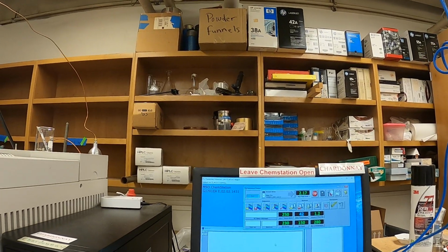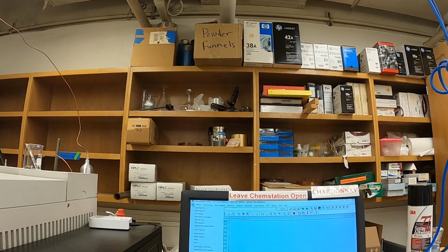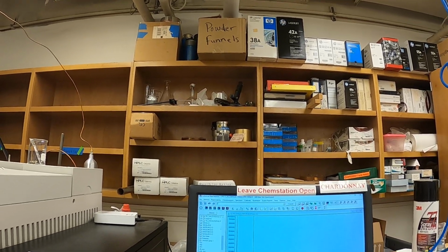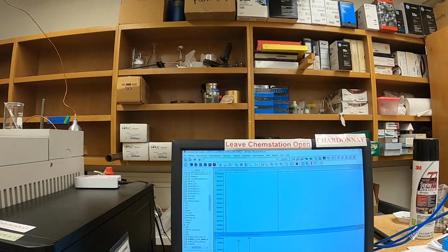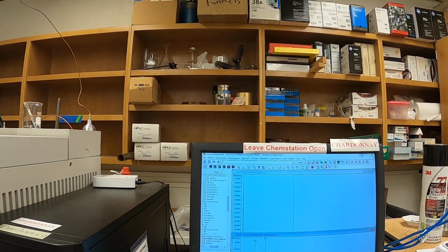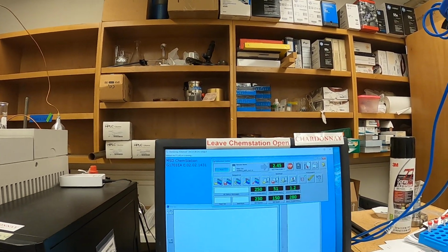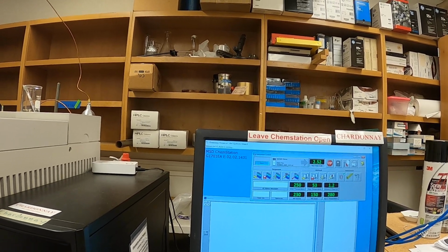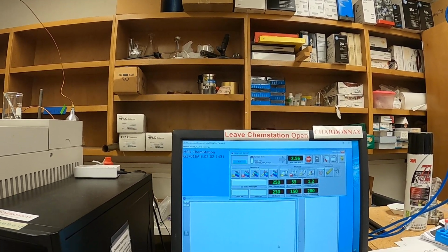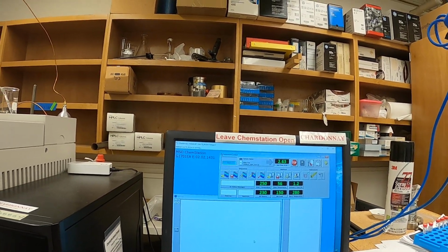All right, let's see where we're at. So, okay, now from this data analysis window, I can go File, take a snapshot, and if we've exceeded the solvent delay, it will give us our run up to that point. Obviously, we're not quite there yet, as it said unable to take a snapshot. Now, if somebody closes out ChemStation and tries to reopen it, we will not have that function. I have to do the total reboot to maintain our online access.